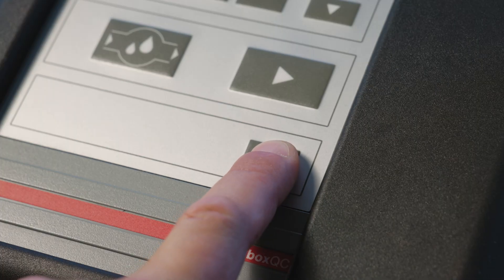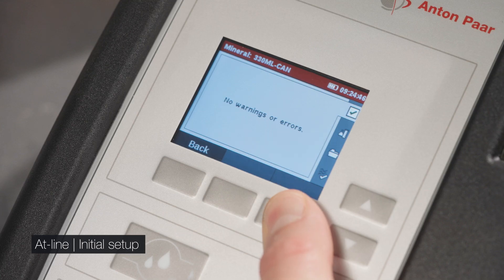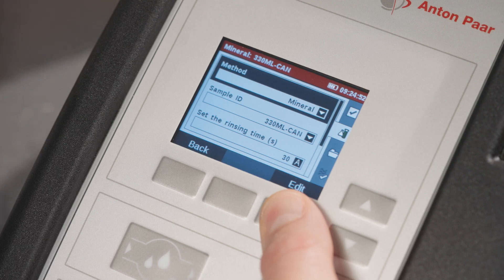Turn on the instrument and check the instrument status. Confirm that the correct method, sample ID, and units are set.